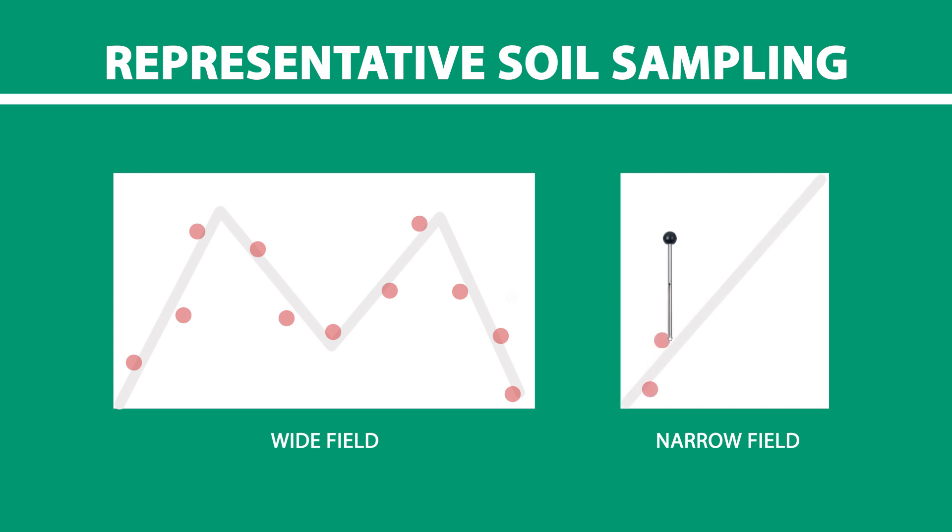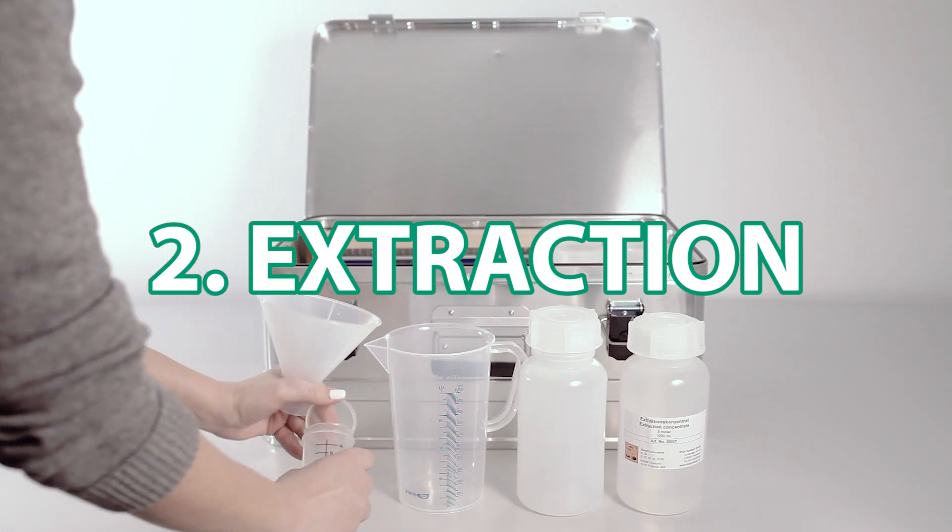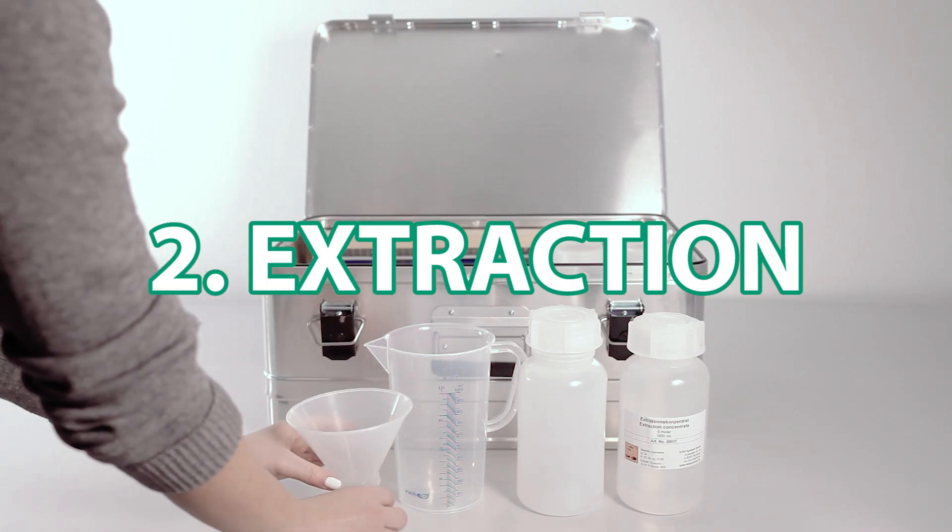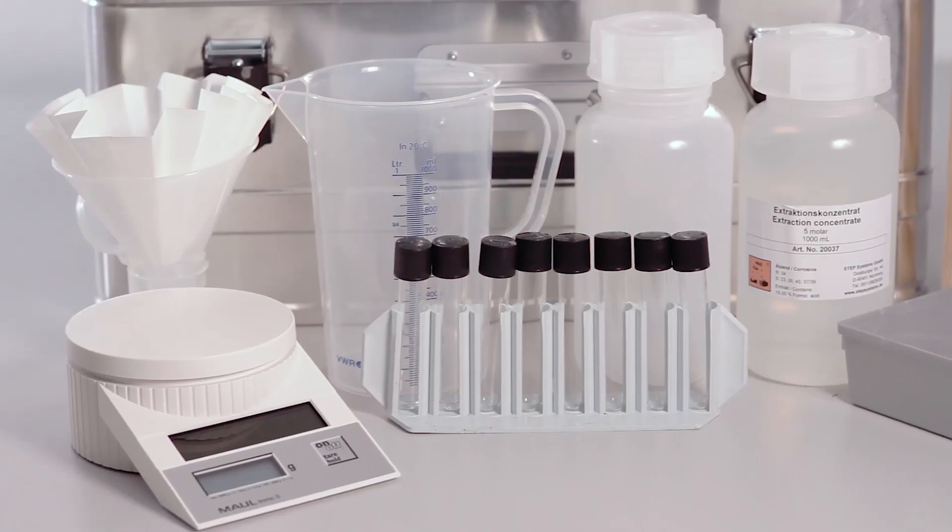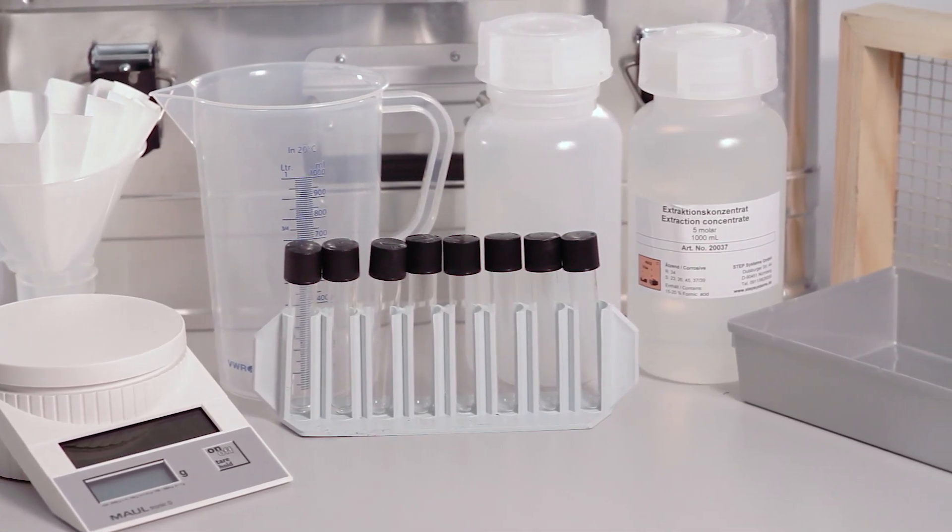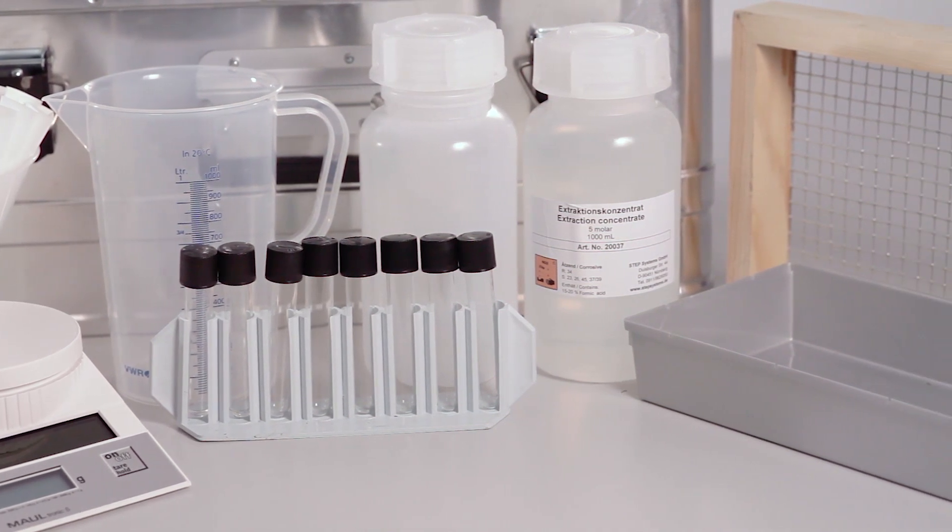Afterwards the samples should be mixed together. The second step is performing extraction on the collected representative sample. The extraction kit includes all the essential tools for sample preparation.